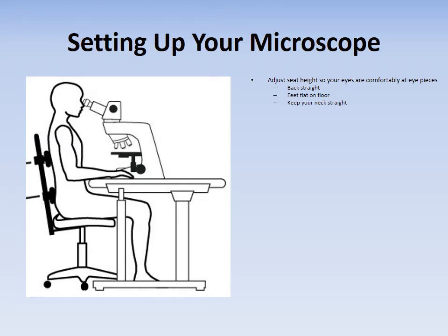Now, if you're only looking through a microscope for a tiny little bit, it might not matter. But if you're looking through a microscope for 8 hours a day, 4 hours a day, it's going to matter. Your body will strain. The parts that are straining are going to start hurting after a while.